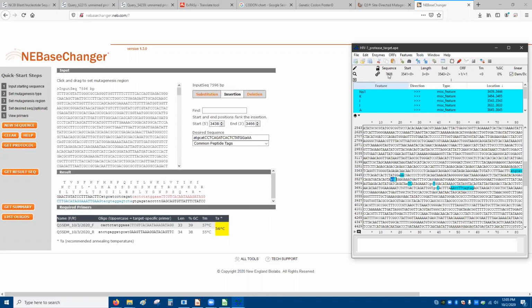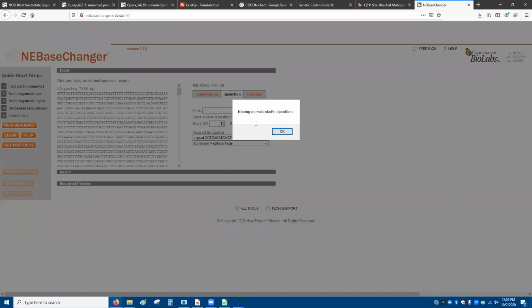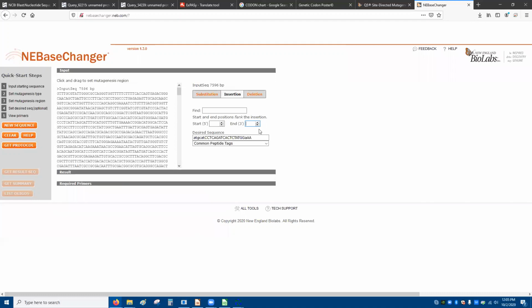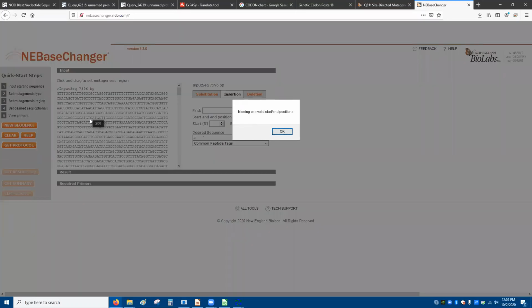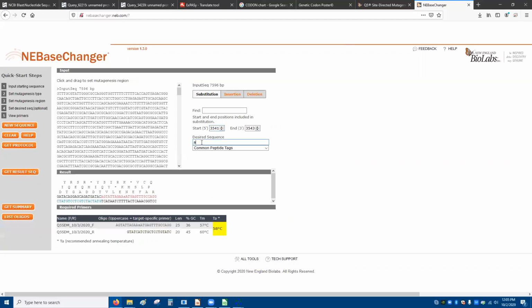So 7608, oh, my bad, 3541 and 3543. This thing is so picky about what you put in here. So we want ATA. Substitution. 3541. ATA.